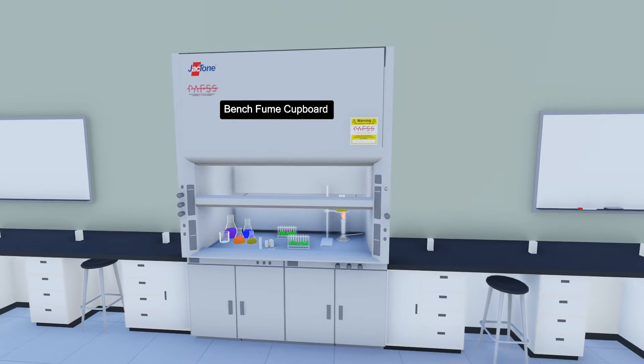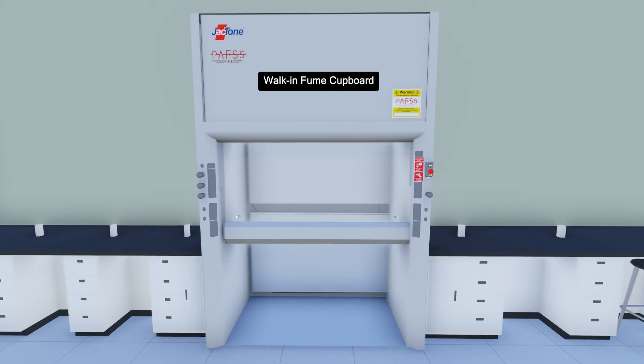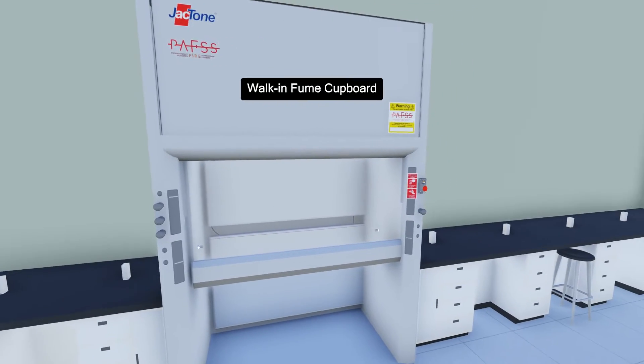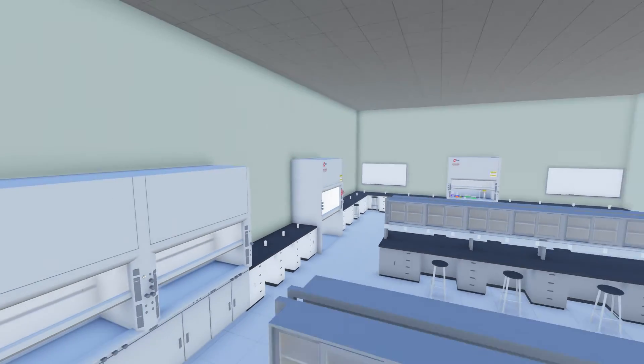PAFS can be fitted to protect both bench type and walk-in type fume cupboards, and is a cost-effective way of protecting not only your fume cupboard, but stopping the spread of fire and limiting the damage to other laboratory equipment.